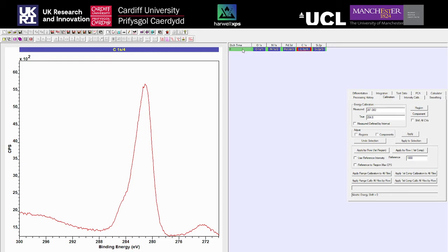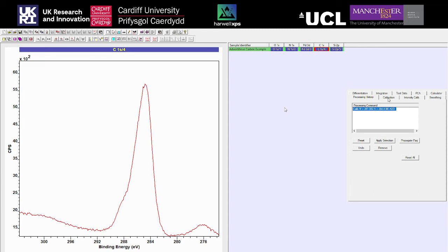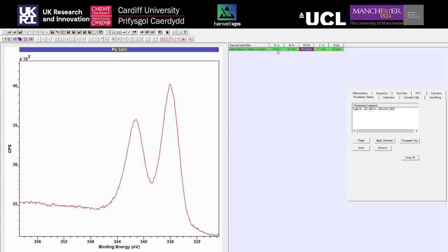Click Edit Mode to toggle the sample name. If you click on the sample name, it will highlight all of the VAMAS blocks associated with that sample. Then click Apply to Selection - you'll see the x-axis shift, moving everything across. We can check by clicking on the peak maximum - it's now at about 284.8, which is what we shifted it to. Under Processing History, we can also see any treatment done to the data, including calibrations, and verify the same calibration has been applied to each block.